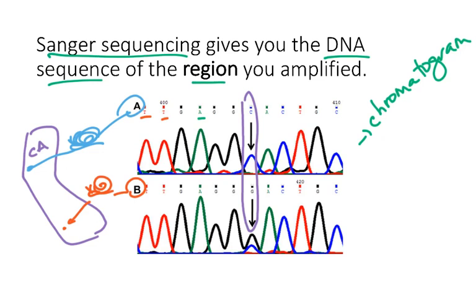That's one of the things we're often looking for when we're looking at this Sanger sequencing data, is to see if there are any nucleotide differences among individuals that are the same species, for instance, but they're from different geographic sites or different populations. And so in this example here, we see that this same nucleotide site, we have a C nucleotide for the Northern California snail and a G nucleotide for the Southern California snail.